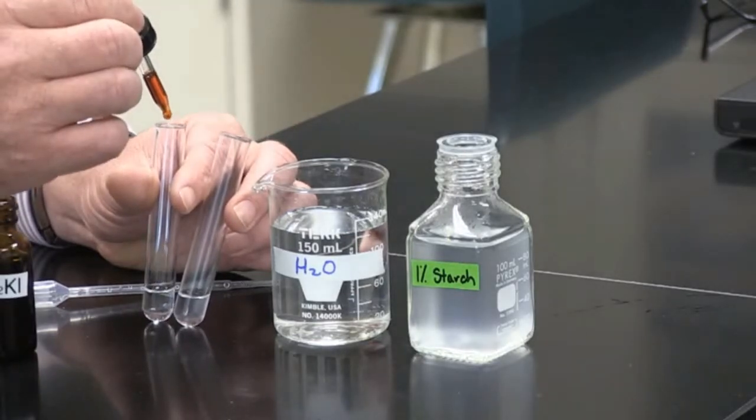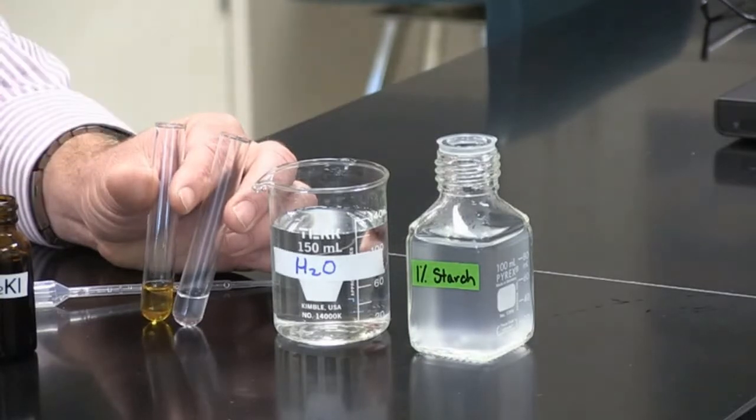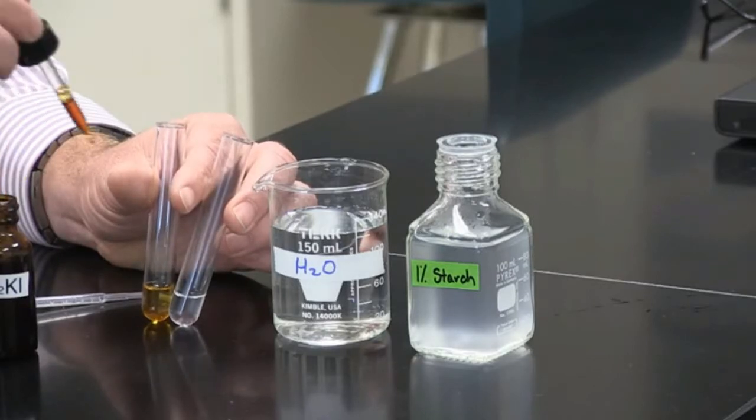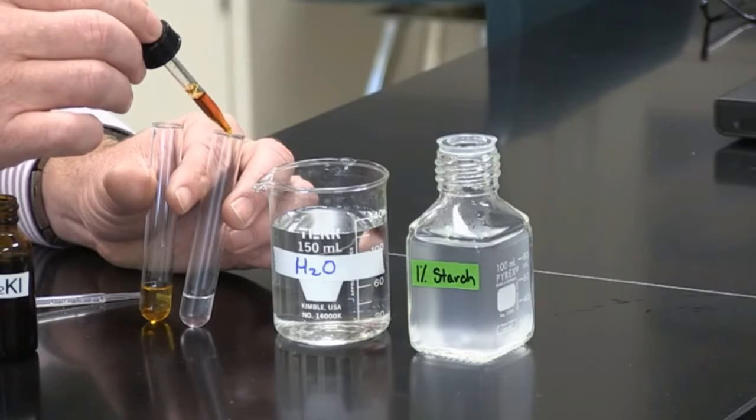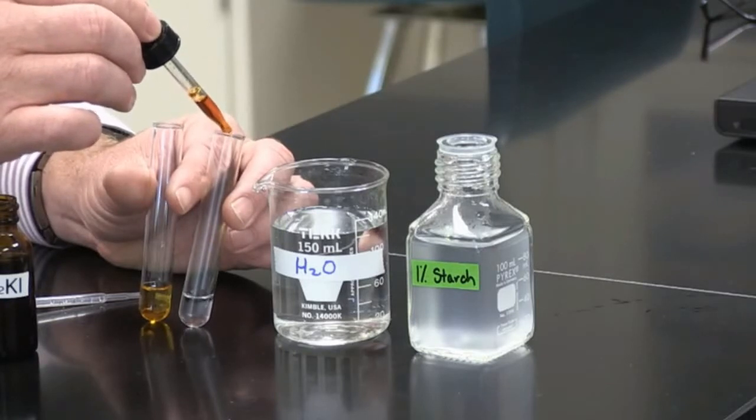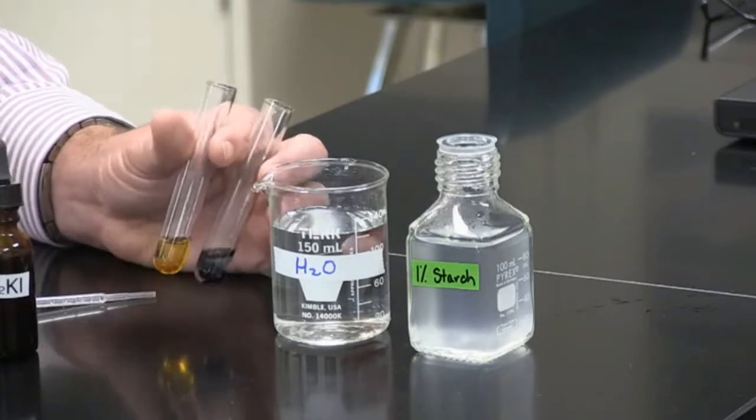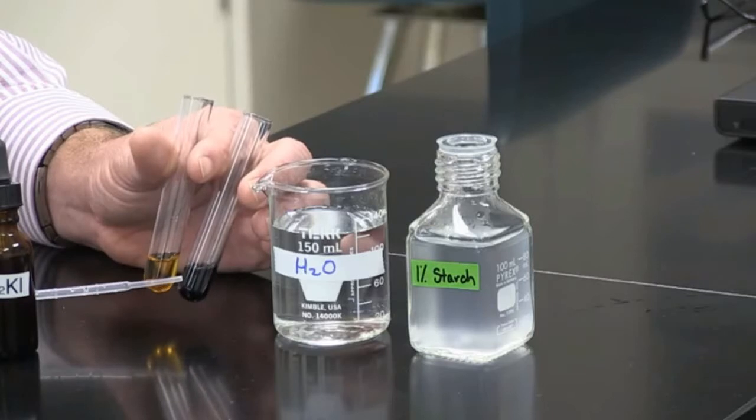So when I put two drops of the indicator in the water, you see that it stays the same amber color as the IKI solution. But when I put drops in the starch container, you see that we get a completely new color. Now we have a dark blue or black color.